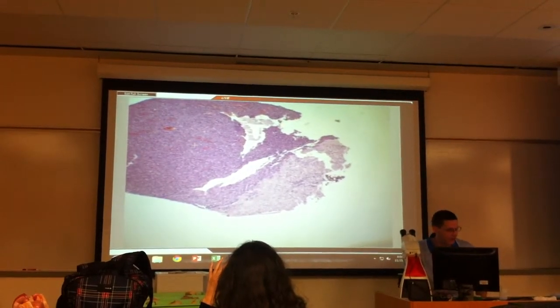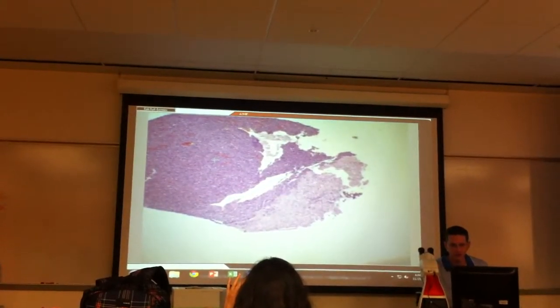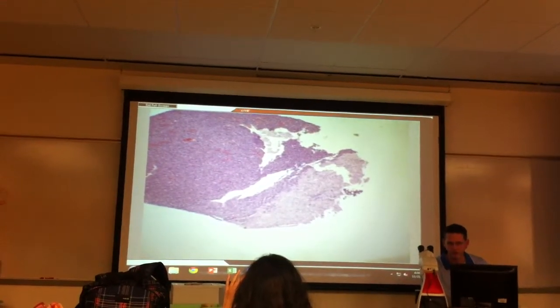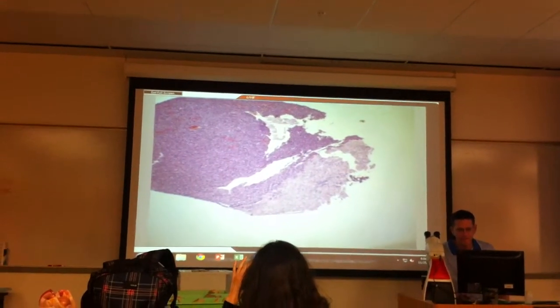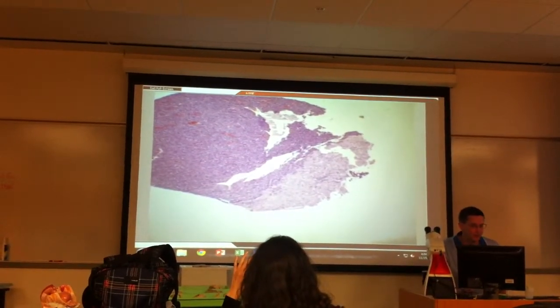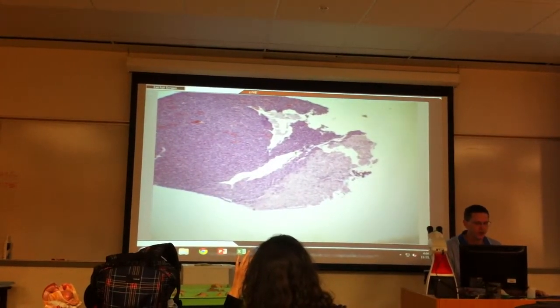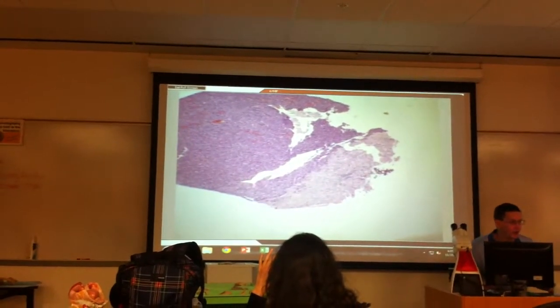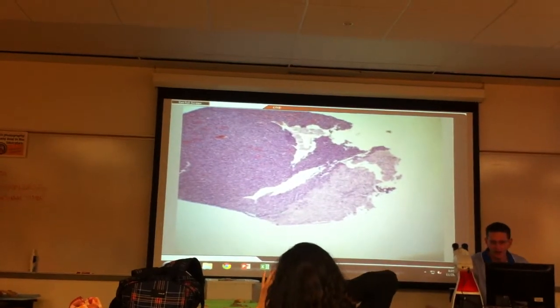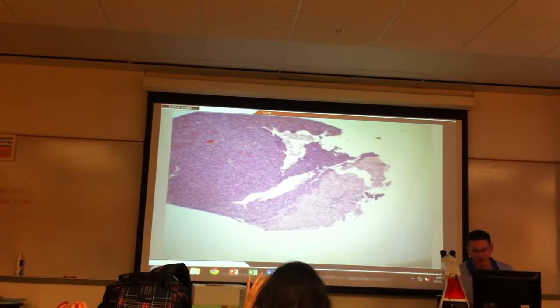The dark part is the anterior pituitary. The anterior lobe is the dark portion. The lighter color here is the posterior lobe of pituitary gland. We'll talk about this in lecture. You don't really care today, but the anterior lobe is a much more traditional gland. It looks like most of the rest of them, lots of dark purple cells. Posterior pituitary is really different. It's mostly neurons. It's actually mostly axons, which is why it's so white. So anyway, the dark-light split: the light side is posterior pituitary, the dark side is anterior pituitary.